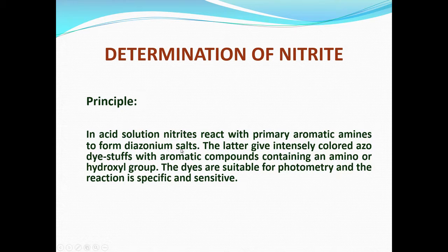What happens is you react the sample containing nitrite with primary aromatic amines to form diazonium salts. This is a very well known chemical reaction. Almost all organic chemists know that nitrites react with primary aromatic amines and they form the diazonium salts.